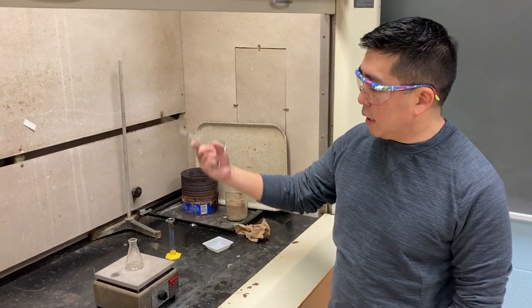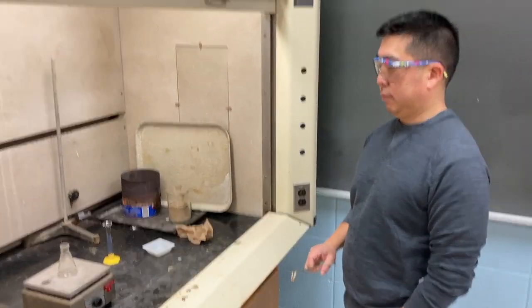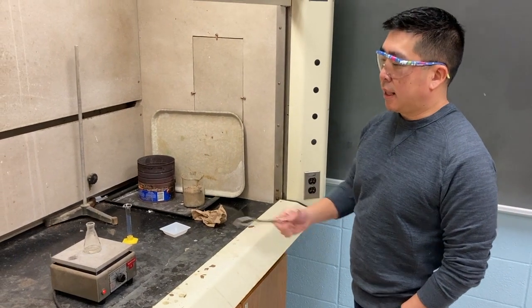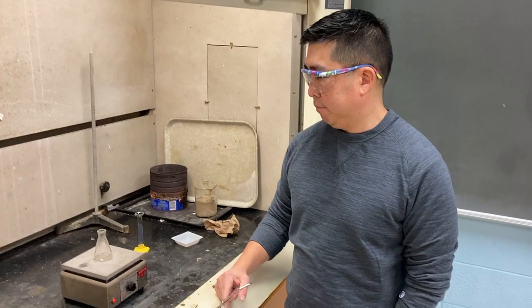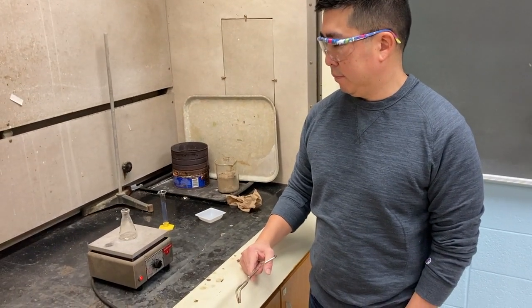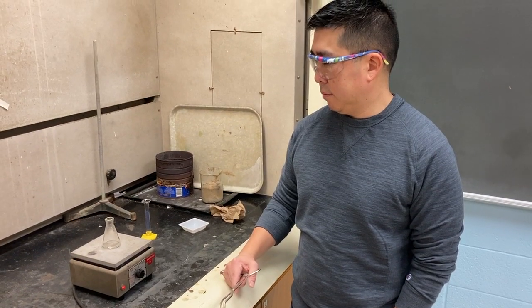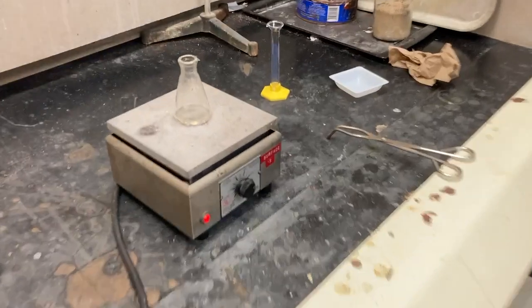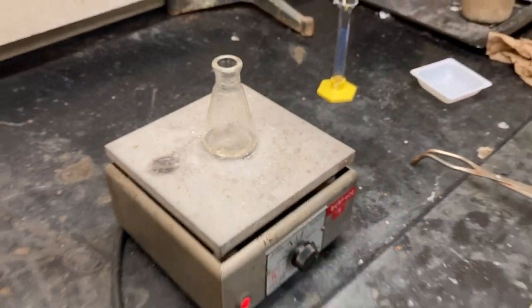But once the water leaves, you'll be able to see the compound. Okay, so the magnesium ion and the chloride ion are dissolved right now, so they're not actually bonded? Not yet. They won't bond until the water leaves. Okay, so they prefer to be in the water over bonded, but once we let the water go away, they'll be closer together, they'll form their bond, and they'll form hopefully some sort of an ionic compound. That's the plan. So we're going to have to just let this heat for a while so that the water can vaporize away. We'll check back on that in a few minutes.